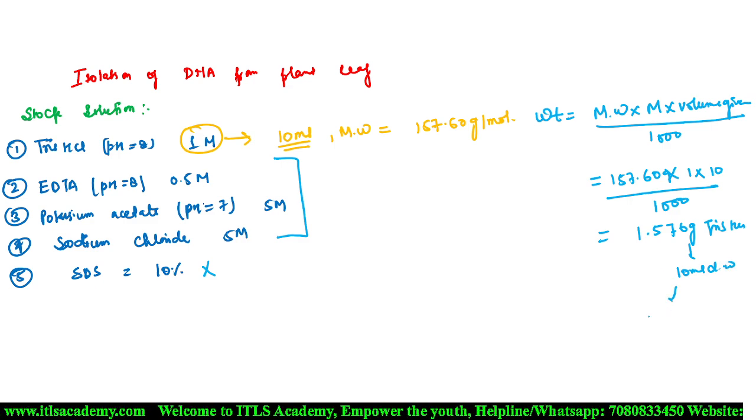Then you get 1 molar of this Tris-HCl. Clear my point? Yes, ma'am. Any doubt?